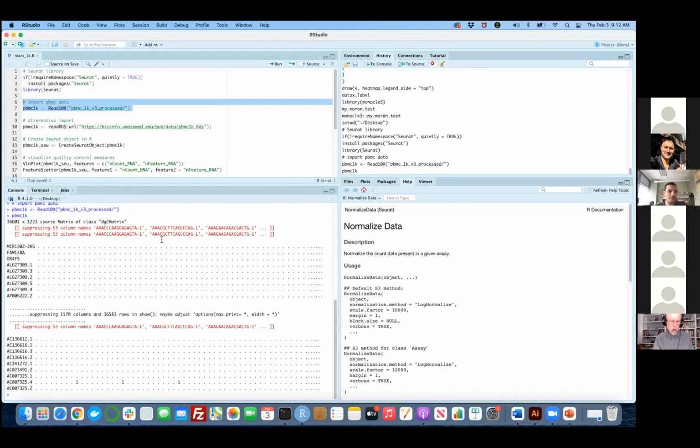So in this kind of a matrix, which will be usually the case for most UMI tables, regardless of the fact that you are using 10x or cell ranger or any other single cell pipeline, you're going to have usually the barcodes as the columns and the genes as rows. So we have done this with bulk as well. In bulk, when we covered that with Alper, the biological samples were usually on the column. So this is basically the same case, but we have barcodes instead of biological replicas, right?